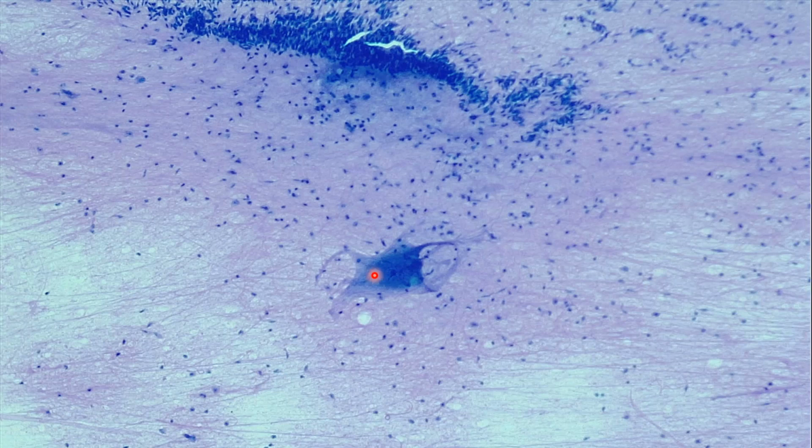But it looks like someone took a blue booger and they just kind of smeared it and wiped it across the slide. So it's going to take whatever shape it wants to take, and that is the neuron. Now you can see the very center of that would be the nucleus. Some of the projections would be like the axon, the dendrites. I don't have my students know the difference between them at this level. I just want them to be able to identify that this is a neuron and that this is the nucleus.